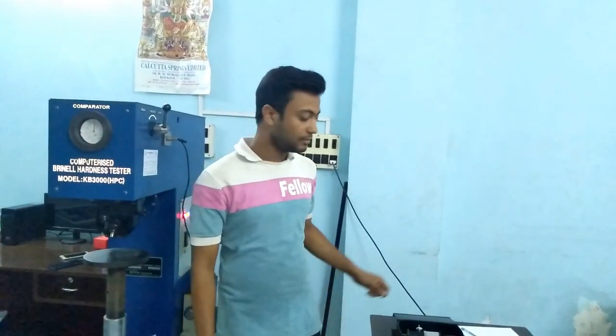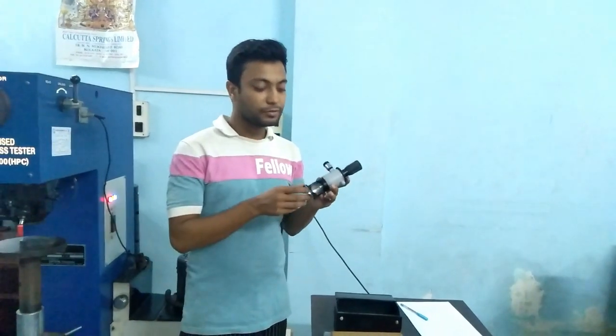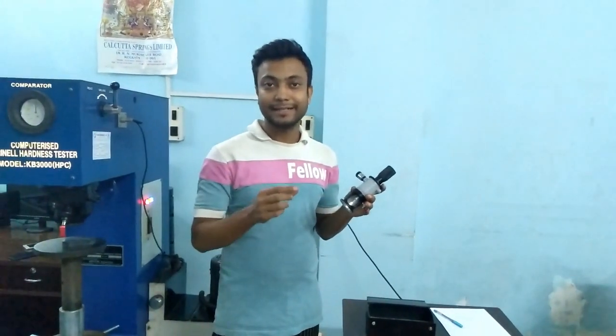Though the machine is computerized, we can still do the test manually. For this, we need a microscope. By this microscope, we can see the indentation sites.